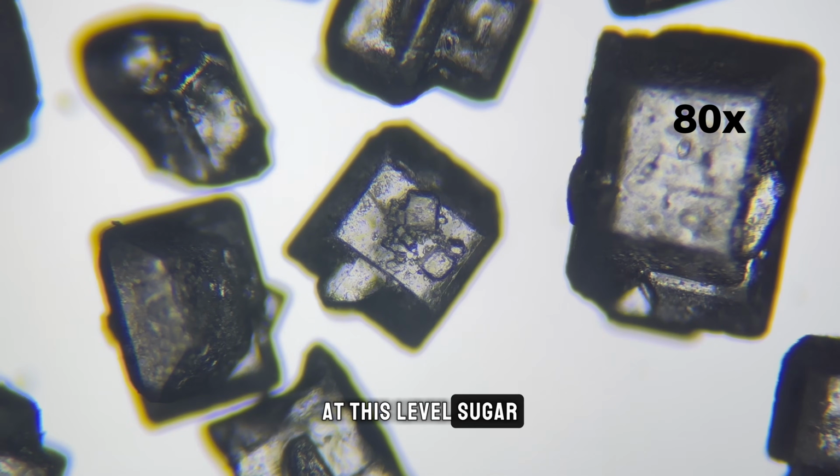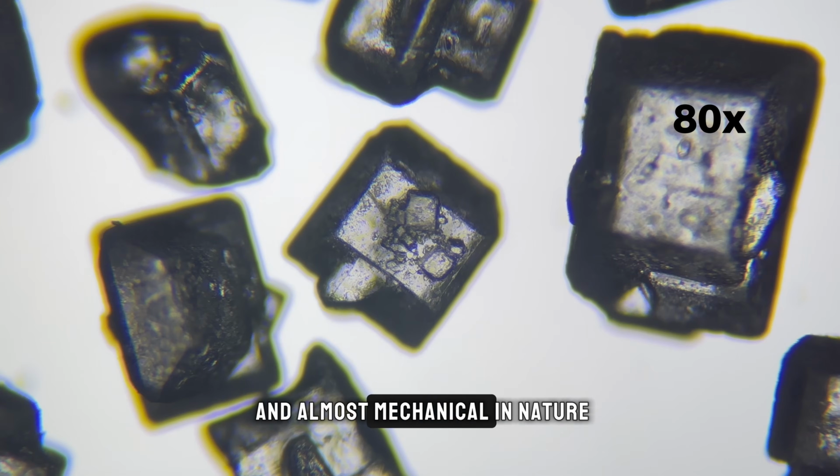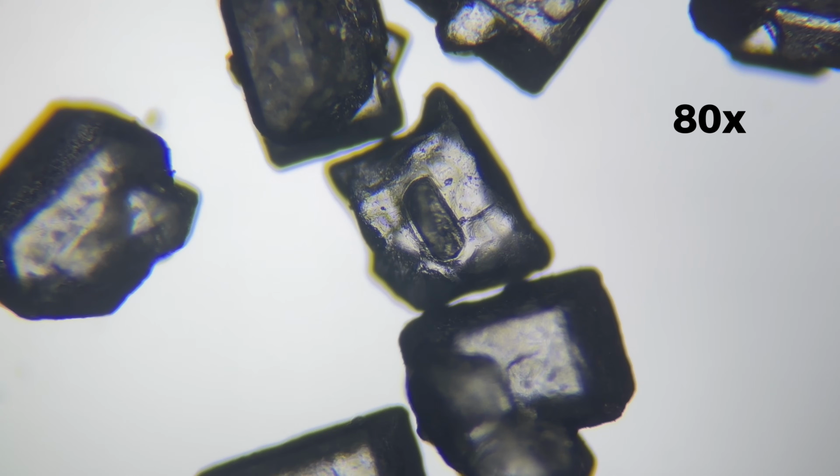At this level, sugar already looks more like a mineral than food. It feels cold, precise, and almost mechanical in nature. This first magnification reveals sugar as a substance built entirely around order and rigidity.